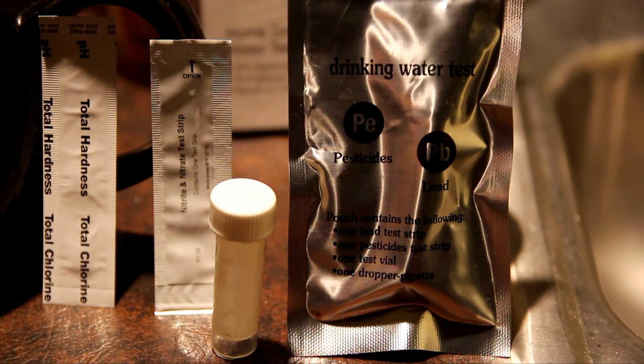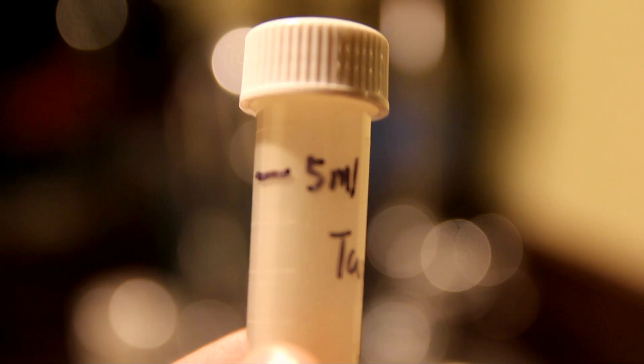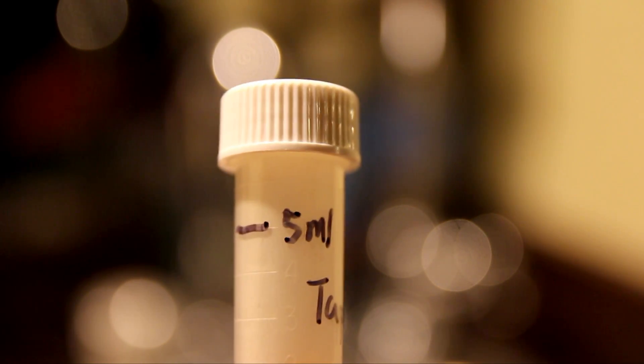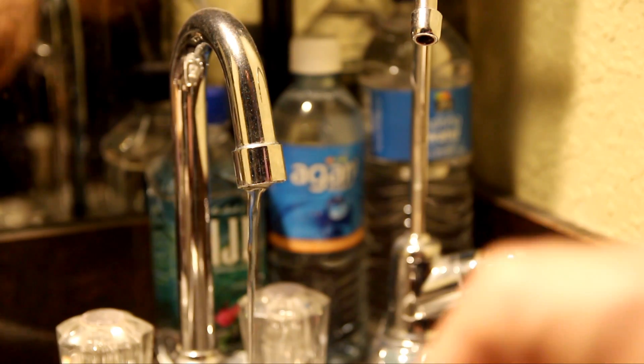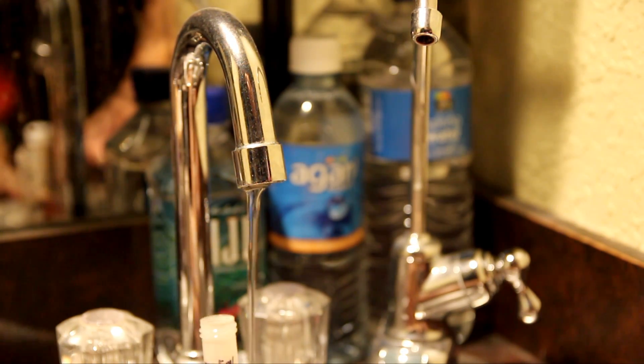The first test I'll do is the bacteria test. According to the instructions, I take out the bacteria test vial, set it straight up on a flat surface, collect water from the tap at a very slow stream, fill it all the way to the 5 milliliter line, do not overfill, put the cap back on, shake the vial for 20 seconds, then let it sit for 48 hours. The instructions say to fill up to the 5 milliliter line, or half an inch from the top. I've allowed the water to run for about 30 seconds to purge the water a little bit.